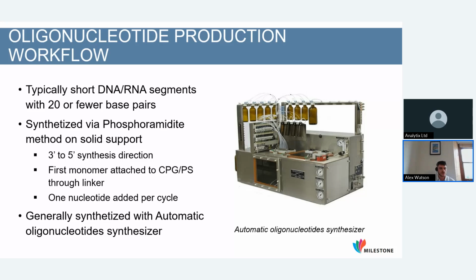And we're doing this on an automatic oligonucleotide synthesizer, which may look something like this. It's just adding a single nucleotide at a time with a few wash steps. Obviously, that is a simplification, but yes.